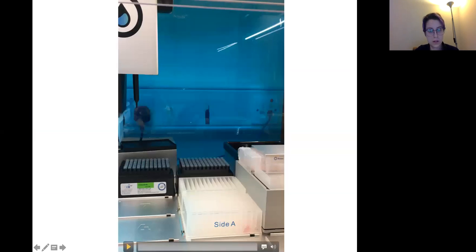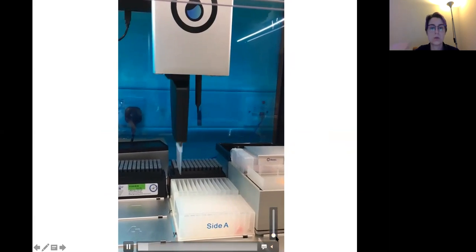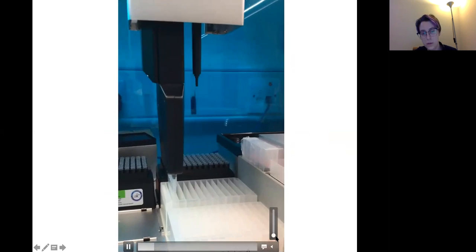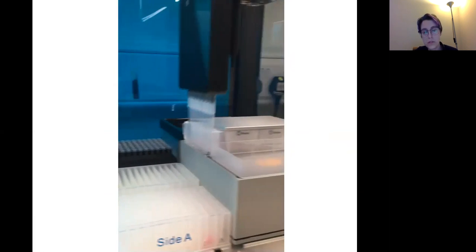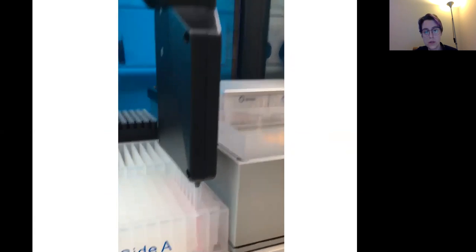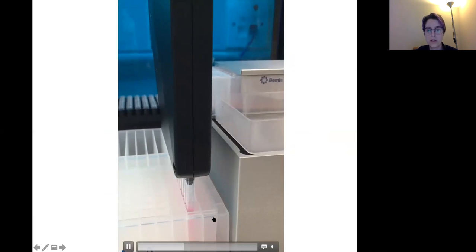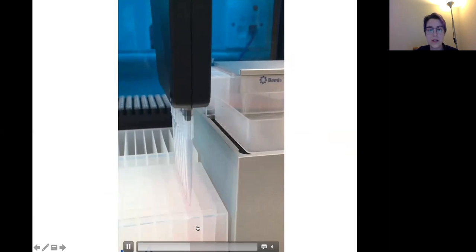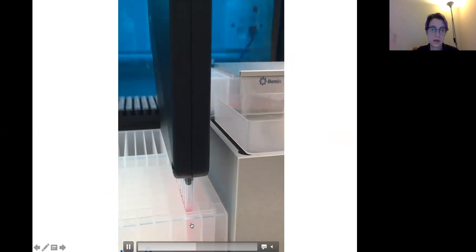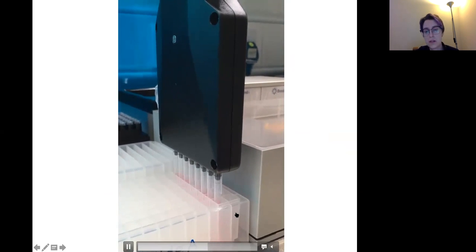And here I conclude. I was talking about the PCR, but for example, what we try to do is also to automate a mini prep. And if someone of you used some mini prep kit, you would recognize this kind of pink liquid that can be pink, can be blue from mini prep kits.